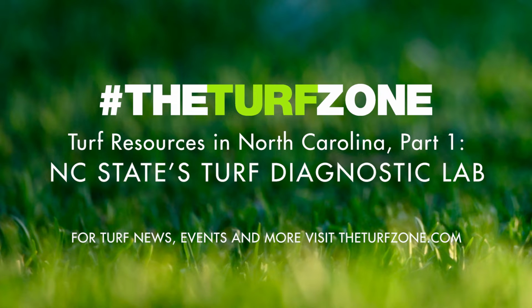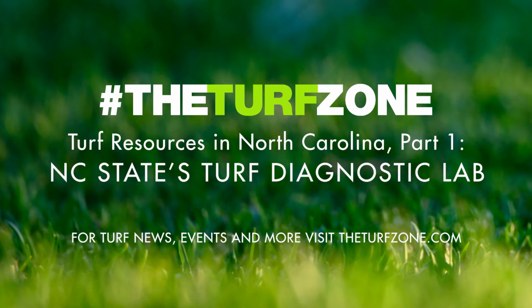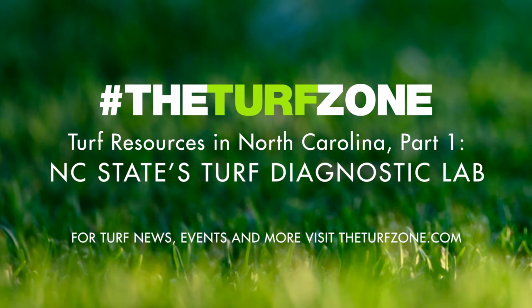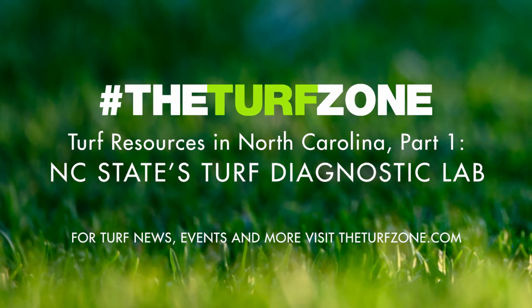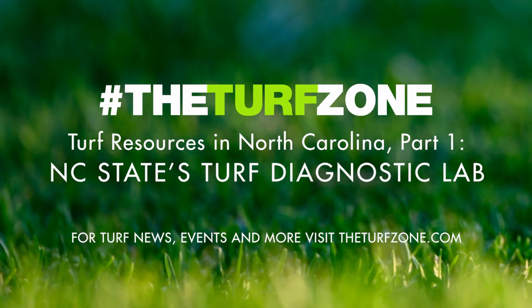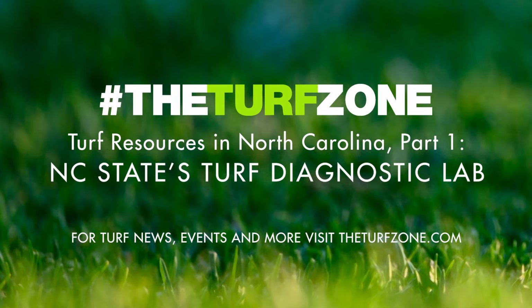In this episode, we feature an article titled Turf Resources in North Carolina, Part 1, NC State's Turf Diagnostic Lab. In this series, we're highlighting the resources that help turfgrass professionals work efficiently and respond quickly to the challenges of turf management. If you have a turf disease problem and don't know what it is, this resource is exactly what you need. Accurate diagnosis of a disease is a critical first step in controlling it quickly and economically.